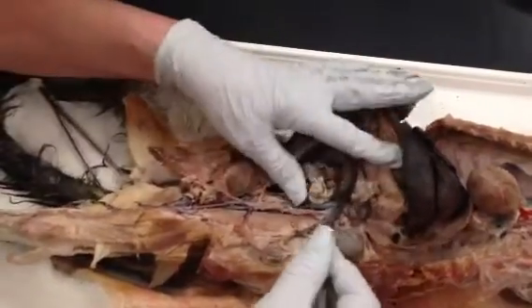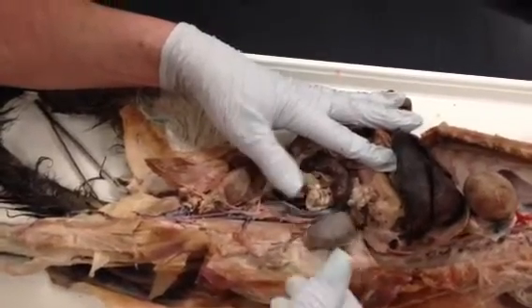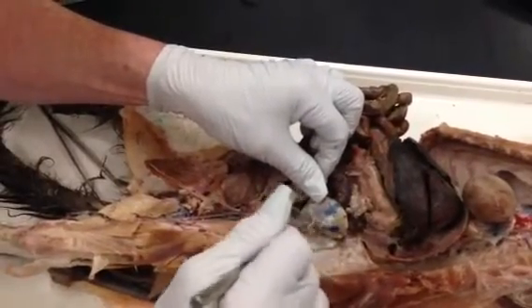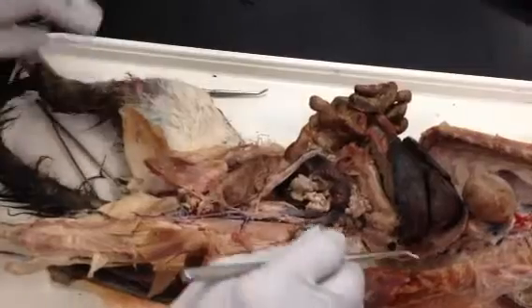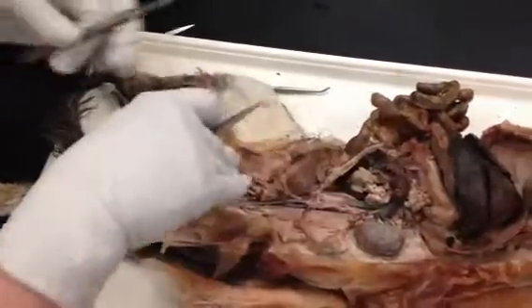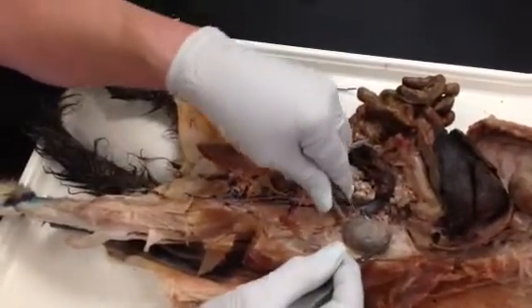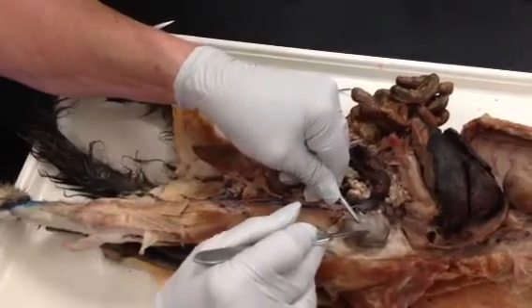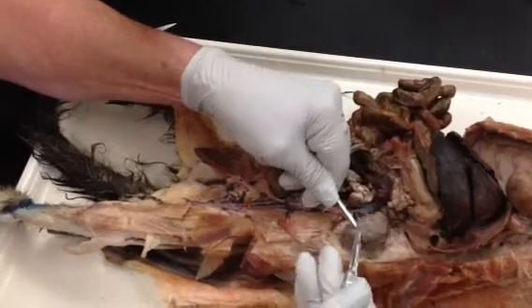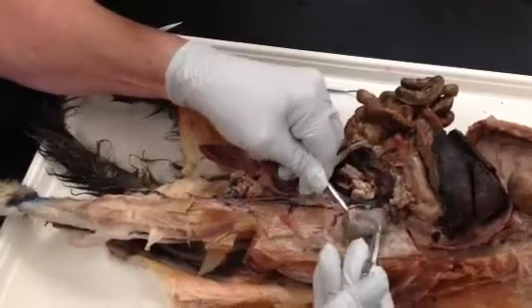Okay, so we see the renal vein, the renal artery. The kidney is still in the capsule. This would be the renal capsule, but it can be taken out. All I have to do is make a small incision and lift it out. Now, this is the renal capsule.